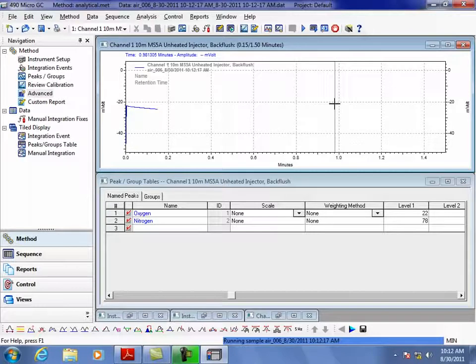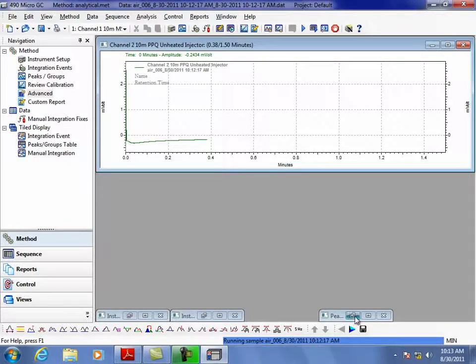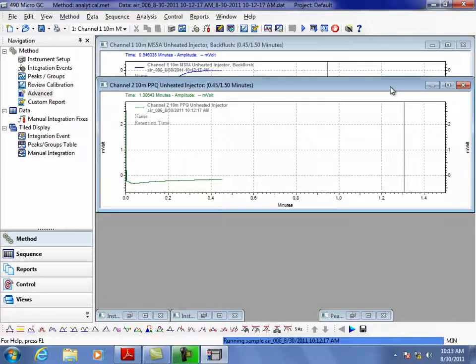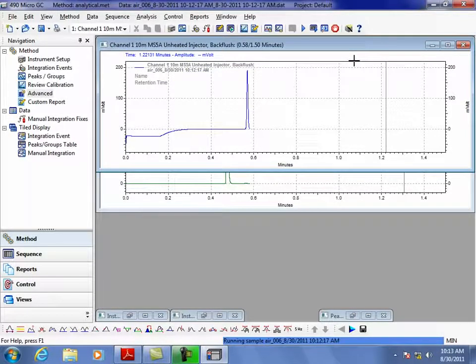You can just name it each time, and it keeps the defaults in, as you can see from what we did before. But the repeated test is good. And once we get a balloon, for example, we will be able to run it 5 times, so we can throw probably the first couple runs out. But even in that case, if you wanted to run 5 runs, set replicates to 5 and it just runs 5. There's no reason not to.